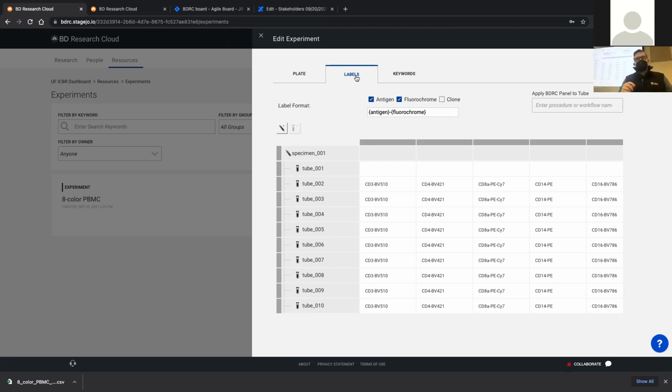start immediately recording. So if you can think about anything that is terrible about the flow cytometry process, we're trying to address those issues. No more USB sticks, we don't want you using them, neither does IT. Everything lives in the cloud, everything is available to you.